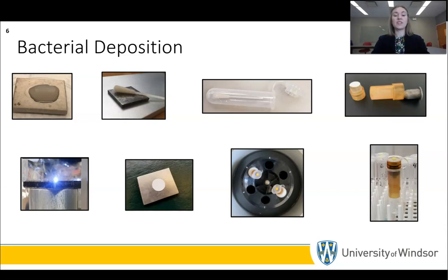First, a bacterial solution is deposited onto a steel plate, which is then heated to remove excess moisture. Next, a damp swab is then used to swab bacteria off the metal plate. Then the swab is vortexed in DI water to shake off all the bacteria from the swab.